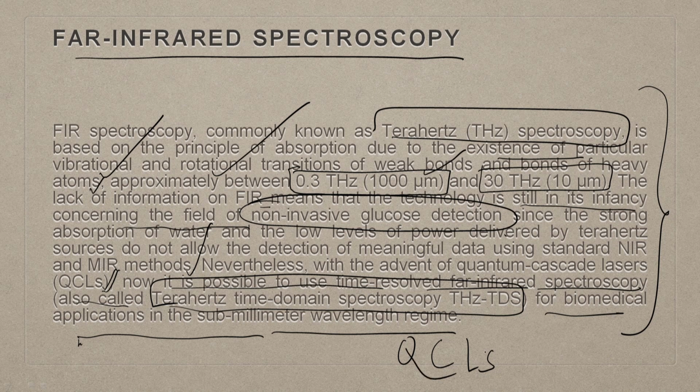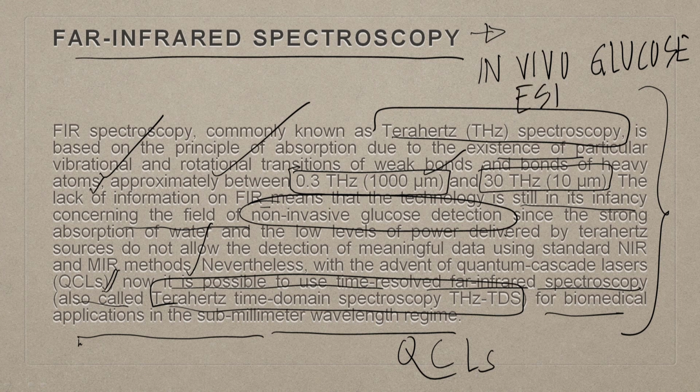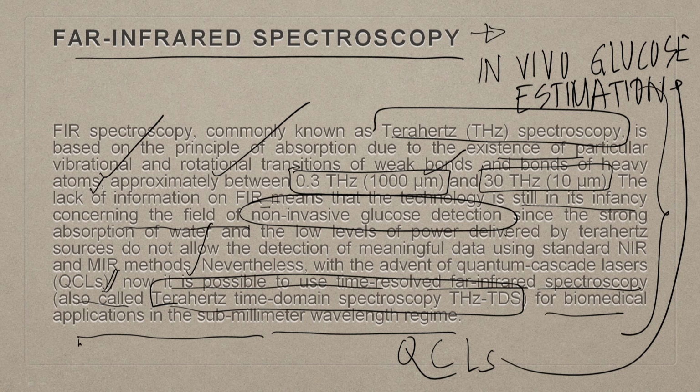It is possible to get time resolved far infrared spectroscopy, and this particular development in laser technology has opened up a lot of opportunity for using far infrared spectroscopy in the near future for in vivo glucose estimation, but not with the traditional far infrared spectroscopy, but using QCL techniques.